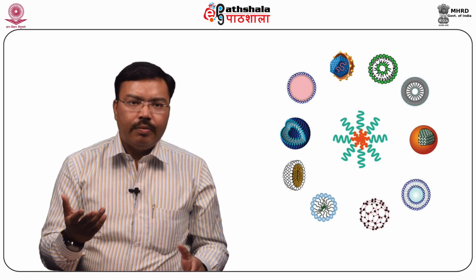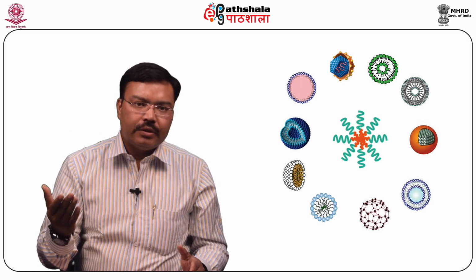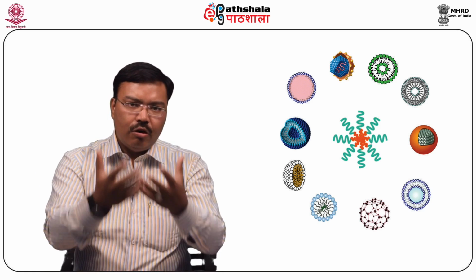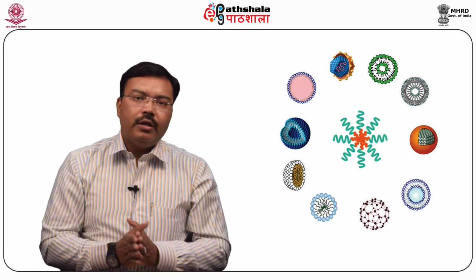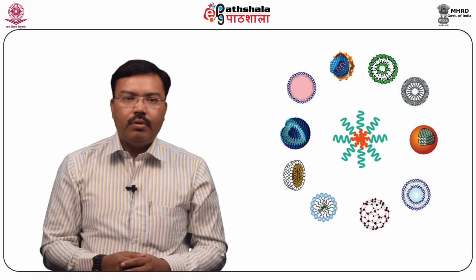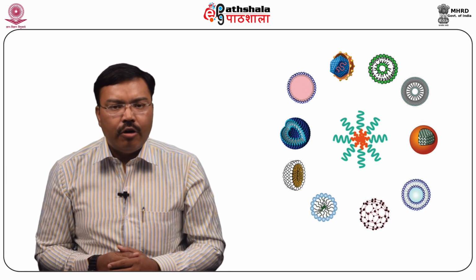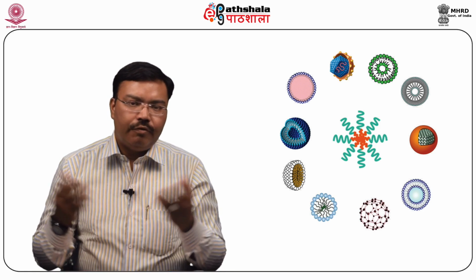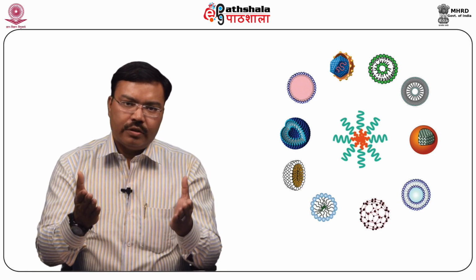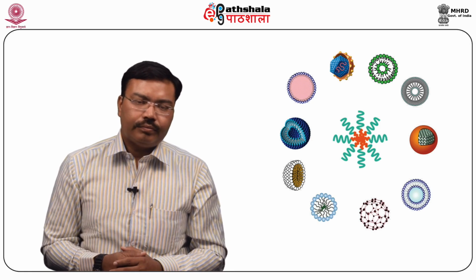After microtome treatment, the samples are sublimed, and after sublimation we obtain cavities or spaces on the slide. These slides are then sent for TEM analysis to obtain a replica for TEM images, and these deeper layer features can be visualized with the help of TEM analysis.